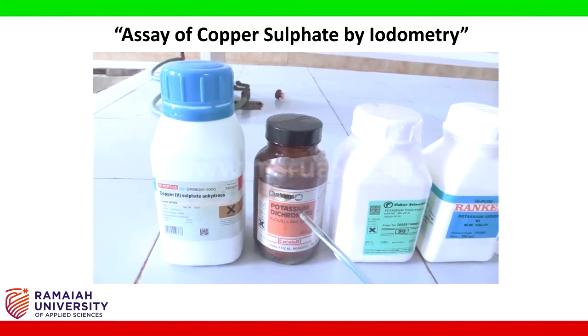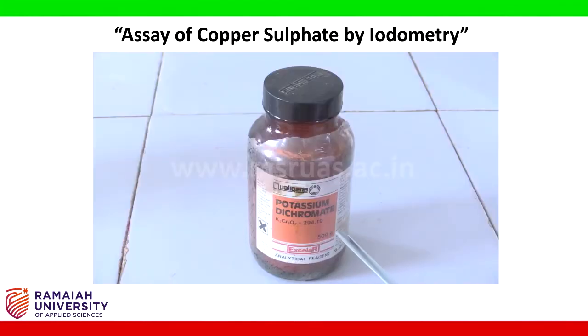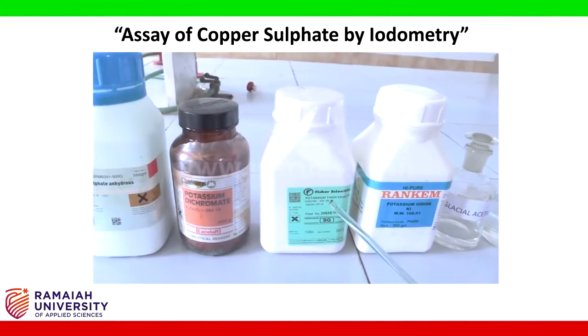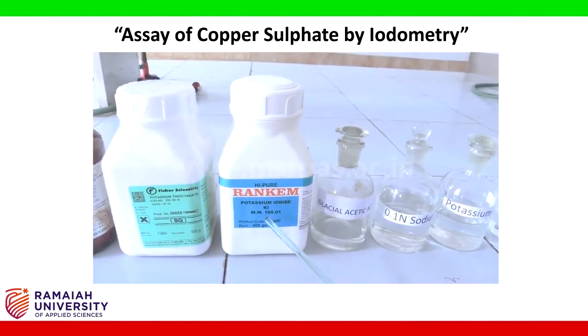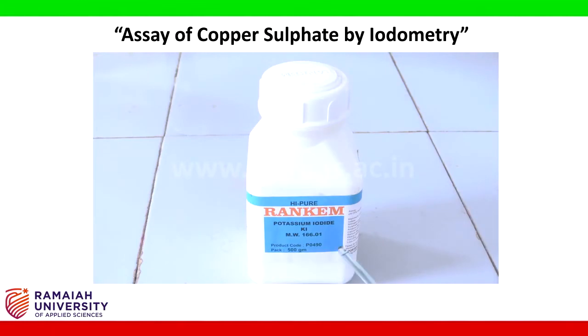determined. Potassium dichromate is a primary standard. It is used to standardize sodium thiosulfate. Potassium thiocyanate is added at the end of the titration to convert into cuprous thiocyanate, which is sparingly soluble in water than cuprous iodide. Potassium iodide is used for the liberation of iodine.